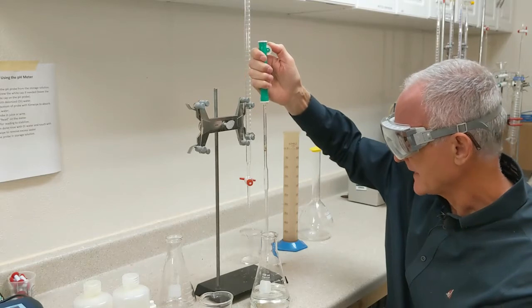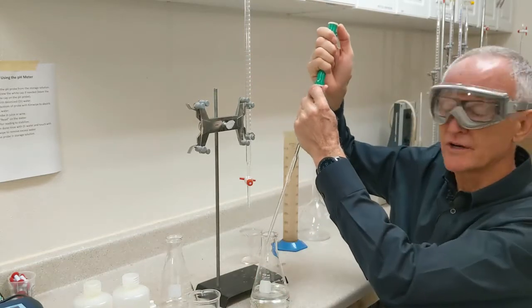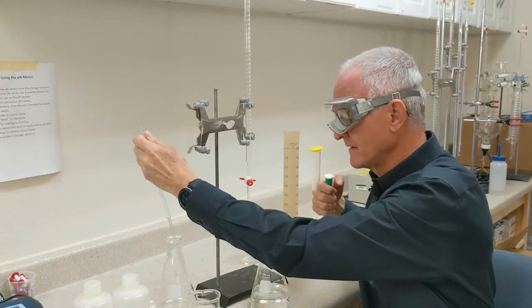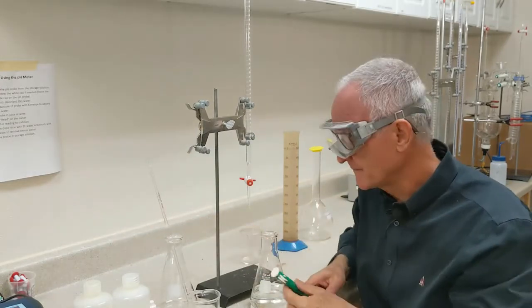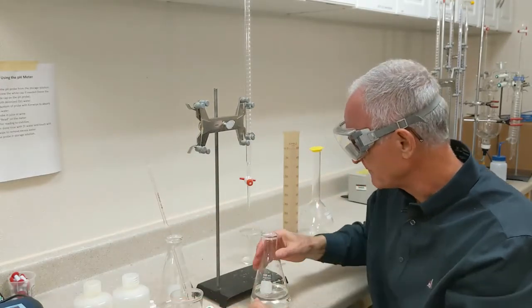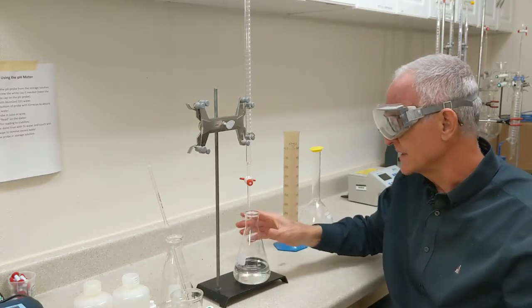I'm going to dispense that into my flask. So now in my flask, I've got 200 mils of water, five drops of phenolphthalein, and five mils of wine. So now I just titrate this.